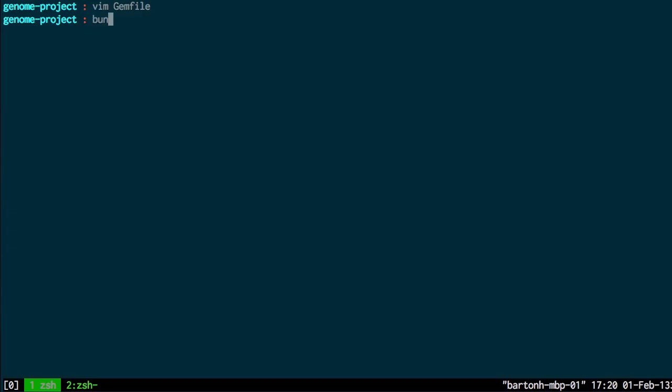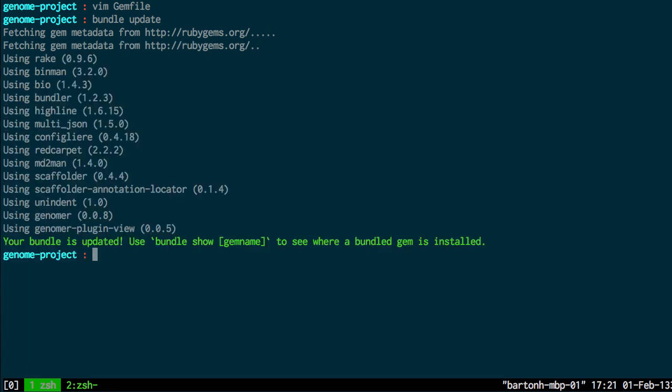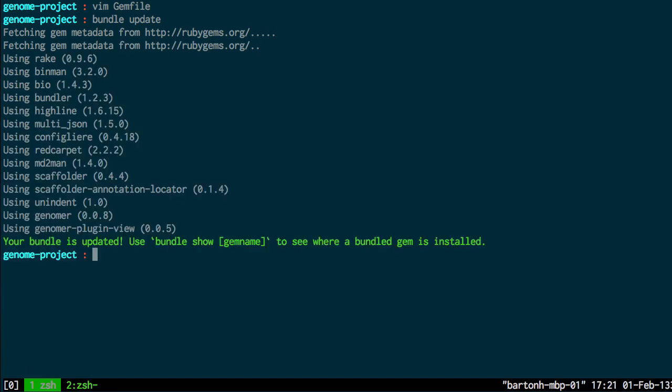And if I do bundle update, that will install all the required plugins. And so you can see here I have Genomer and then Genomer plugin view is installed now.